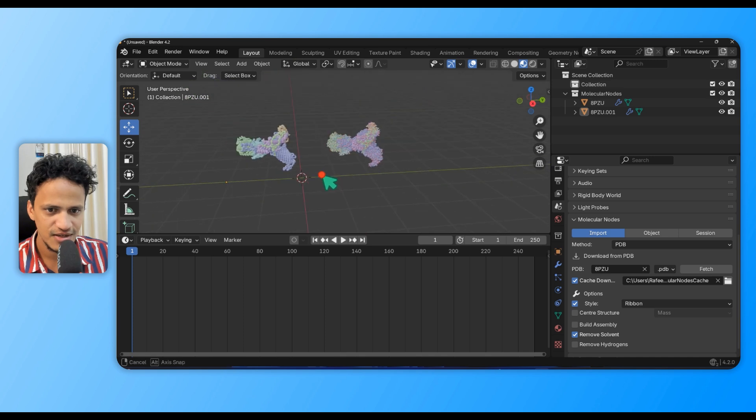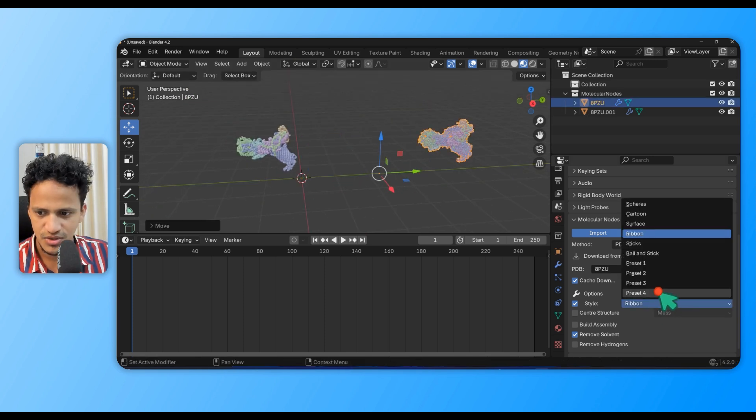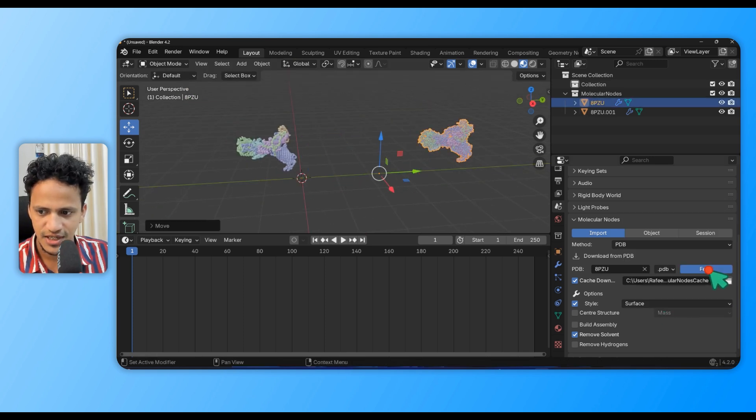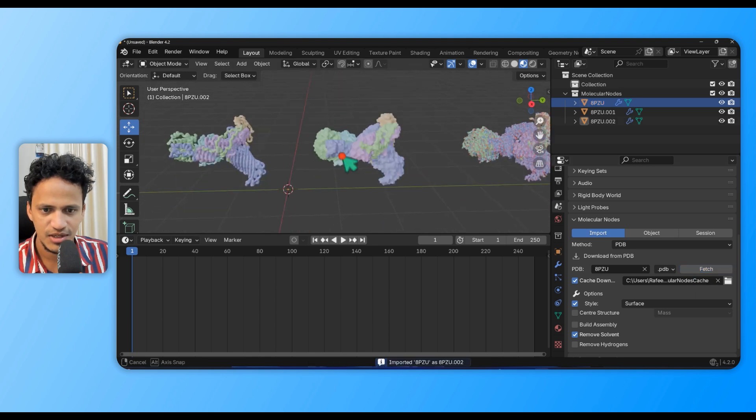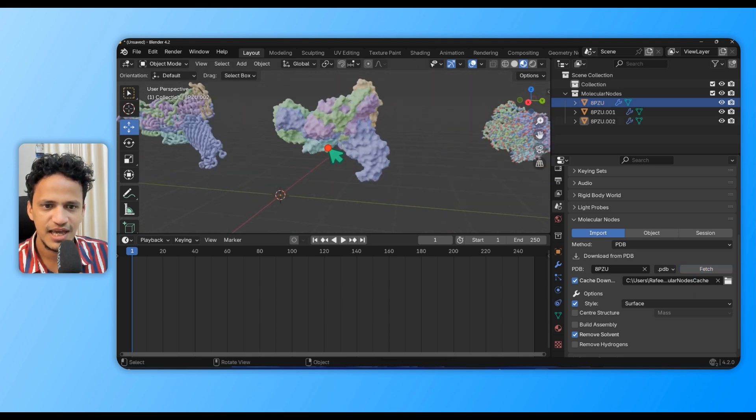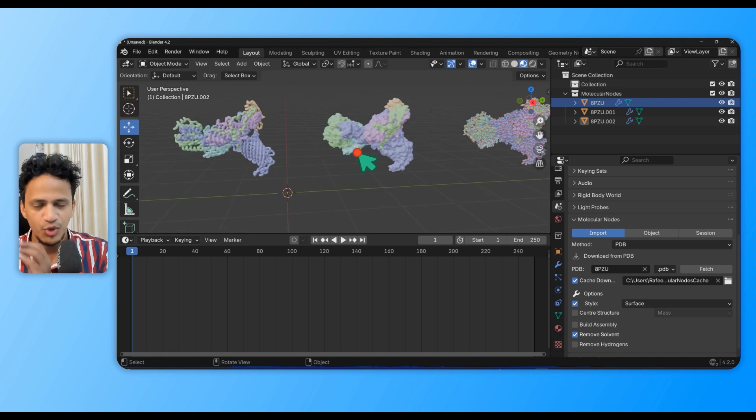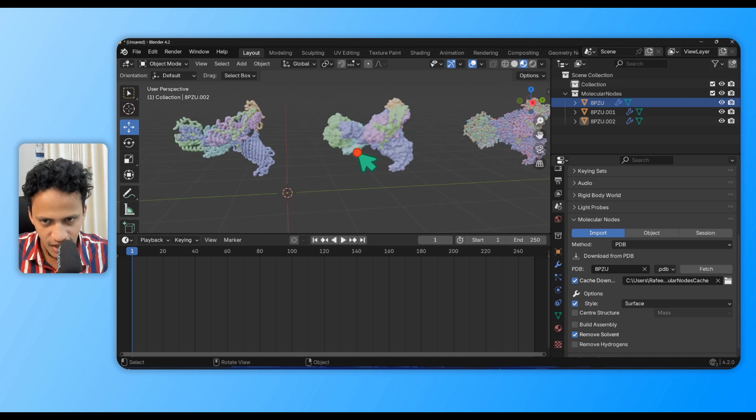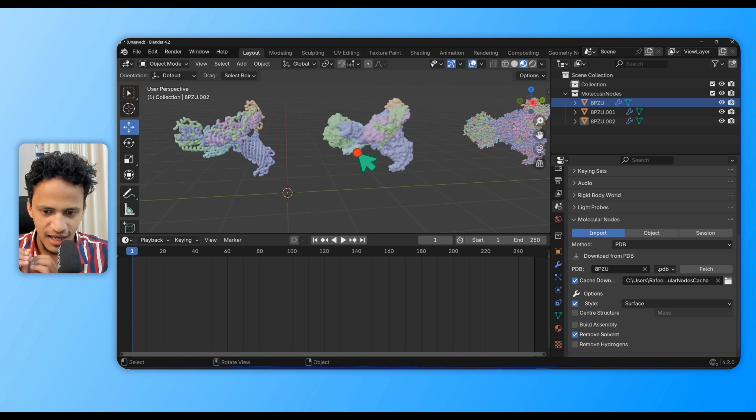Now change this to Surface and fetch again. See, we have the protein in different formats. We can control everything, like how to color a specific chain in a specific color - everything can be done.